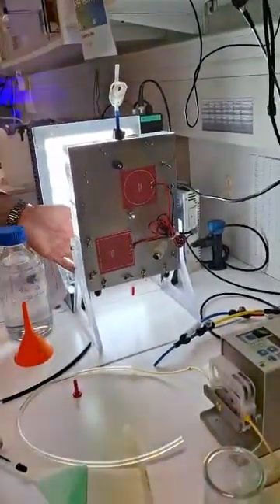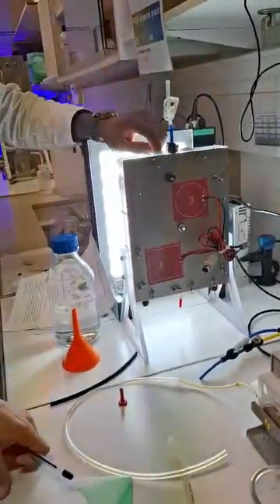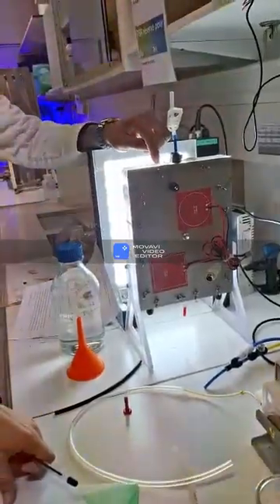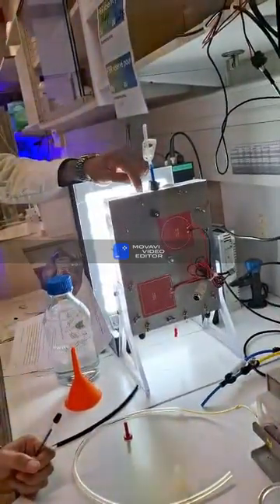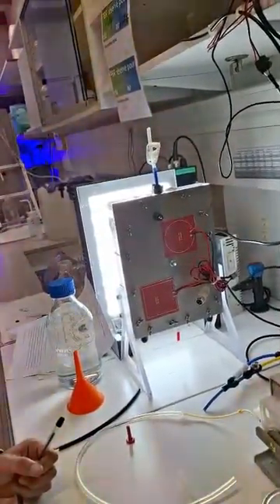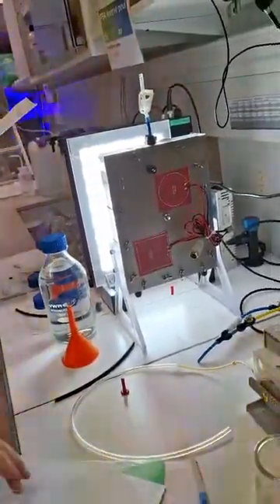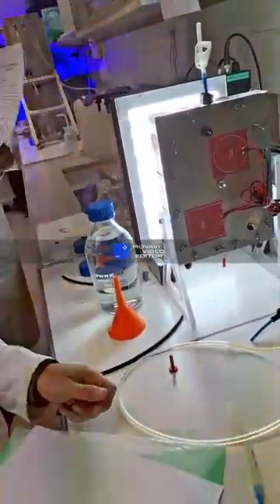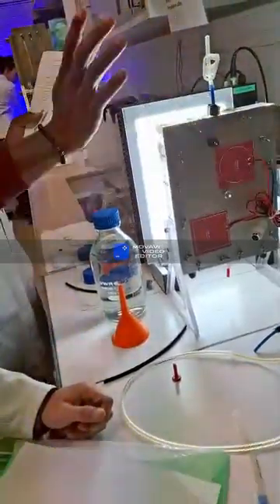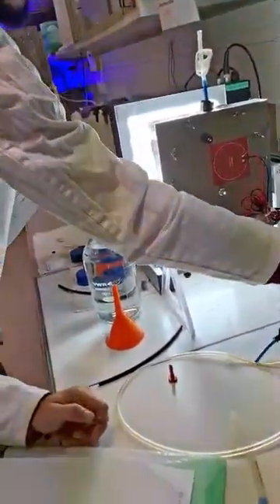And if you have sedimentation, you have the magnetic bar. So that's it. And what do you think is going here? For lubrication? No. Do you have any idea? I think this is gas out. One is gas out. What about this? The pH probe, because you have to monitor the pH inside. Ah, the regulate sensor, the CO2 sensor. And here you have an electro valve.